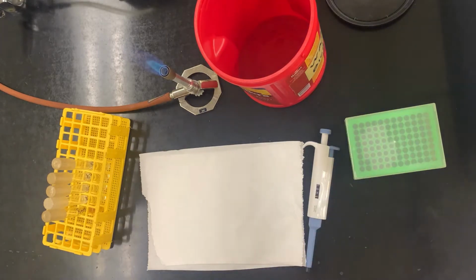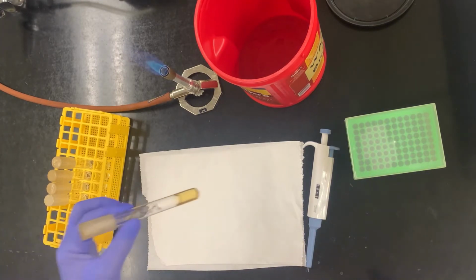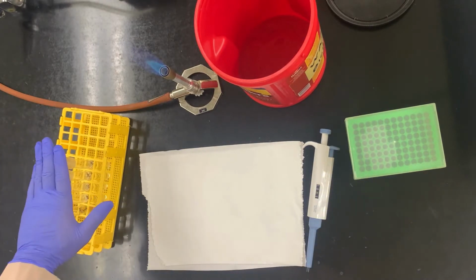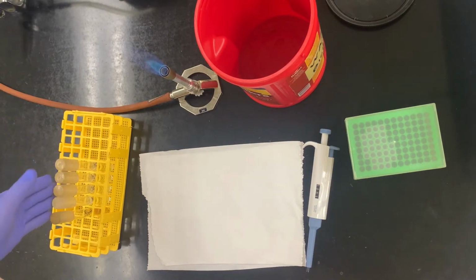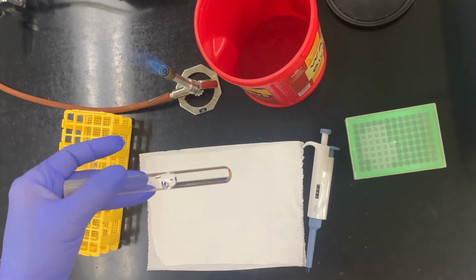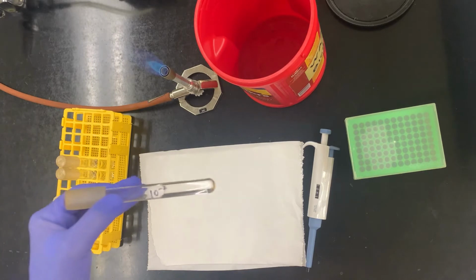All right, so here I got my station set up. This is my broth culture, and then I have my water blanks. Remember, each of these contains 9 milliliters of sterile water. Everything is pre-labeled. So here I have 10 to the minus 1, 10 to the minus 2, and that's my preference for labeling.